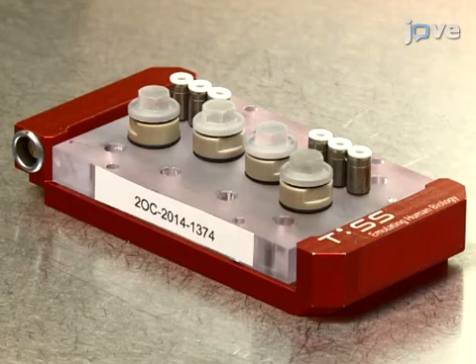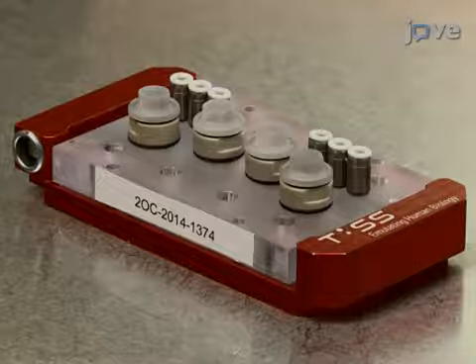Once the multi-organ chip, or MOC, has been fabricated following the TEXT protocol, remove the medium from Human Dermal Microchannels.